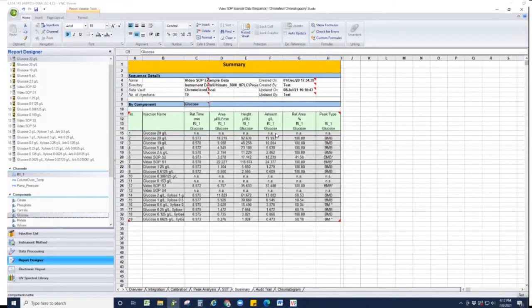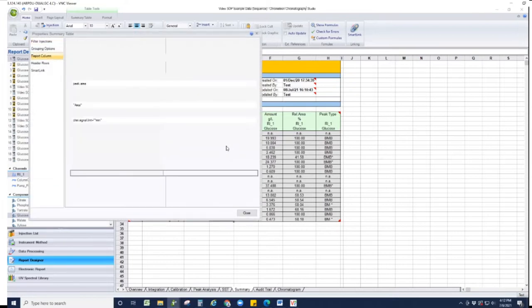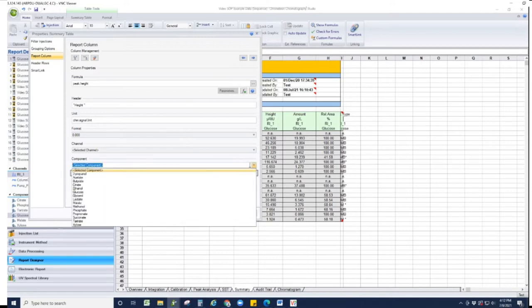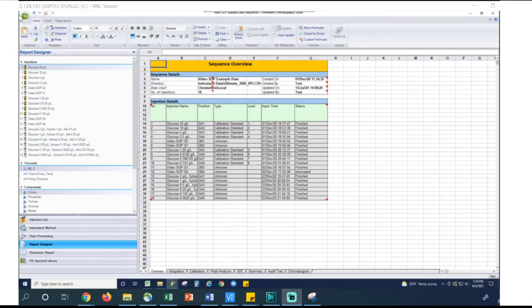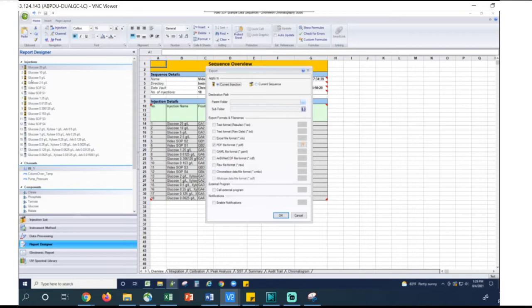Insert columns by right-clicking on the report and selecting Insert Column. You can then select and edit the formula and component you want to add to the report. When the report is complete, select the chameleon icon in the top left and navigate to Export. Save the report according to the file type and location you want.